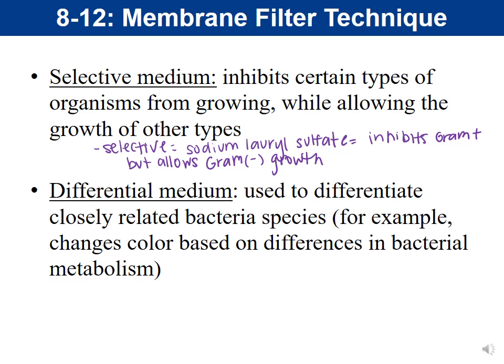In our LTB, our differential ingredient is going to be our lactose, because we want to determine if it's fermented.